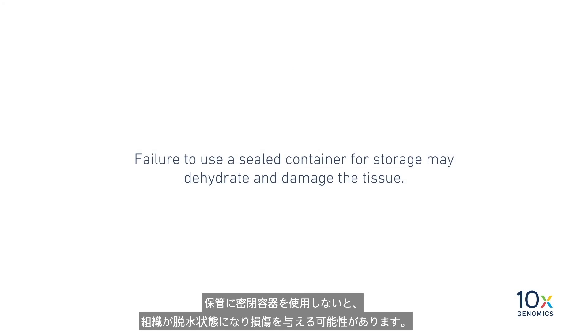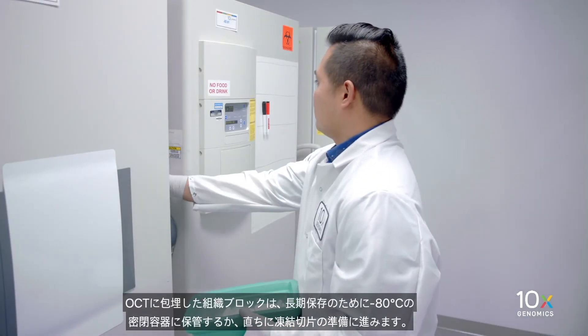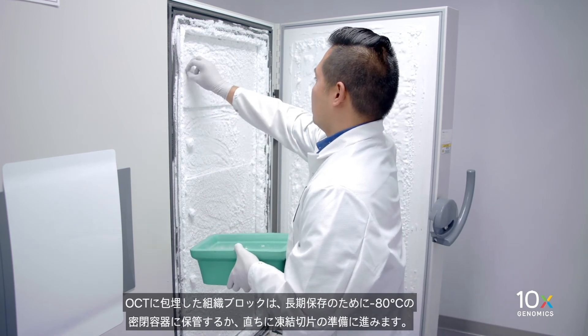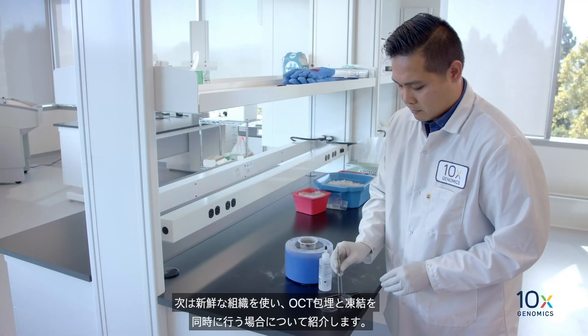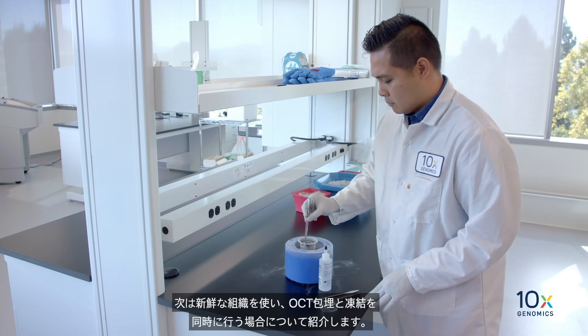Failure to use a sealed container for storage may dehydrate and damage the tissue. Store the OCT embedded tissue block in a sealed container at minus 80 degrees Celsius for long-term storage, or immediately proceed to cryo sectioning and section placement. We have OCT embedded the frozen tissue and next, we will simultaneously freeze and OCT embed fresh tissue.